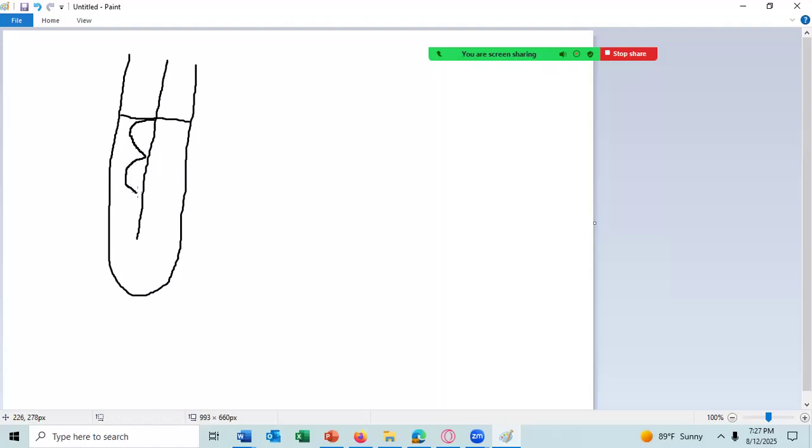A little more than just on the stab there, because it flares out. Let's make it an uneven one here, one there. Something like that. So that's a flare. Any question about any of that?